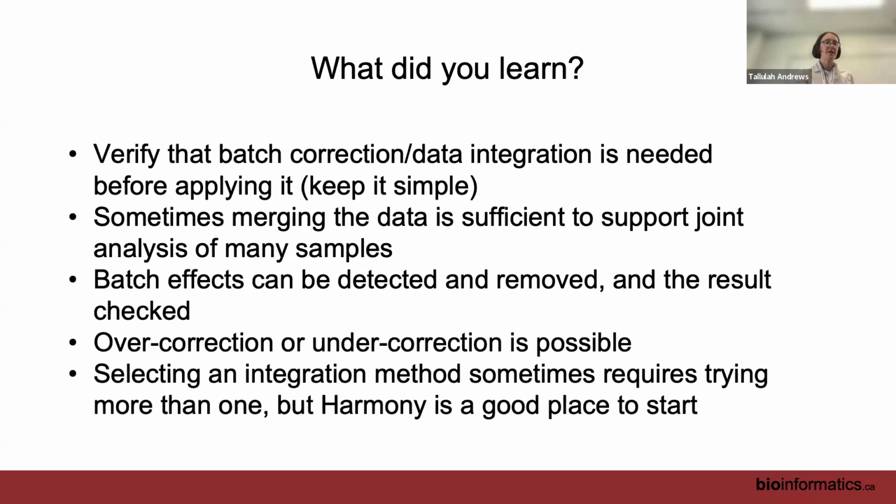And when you're selecting an integration method, you may have to try multiple ones. But it's suggested by multiple people and multiple papers that harmony is a good place to start, because it will usually work. And if it works for you without erasing your biology, you're basically good to go.